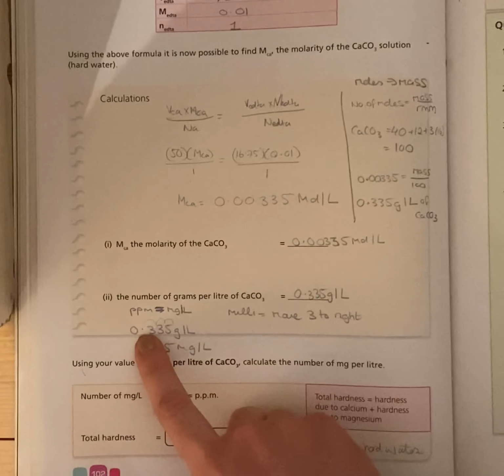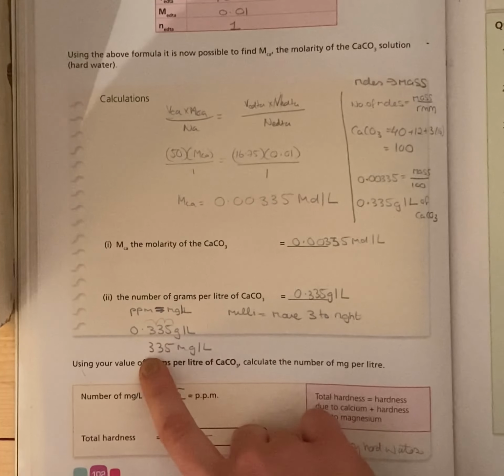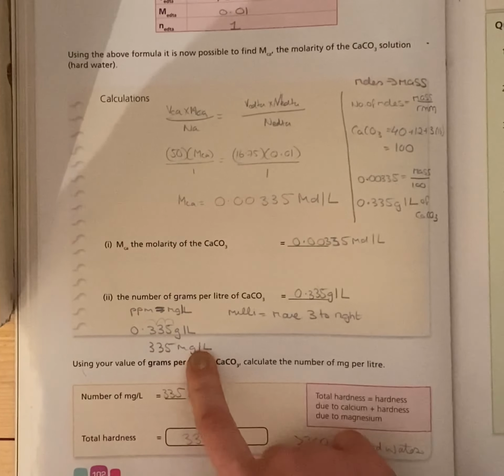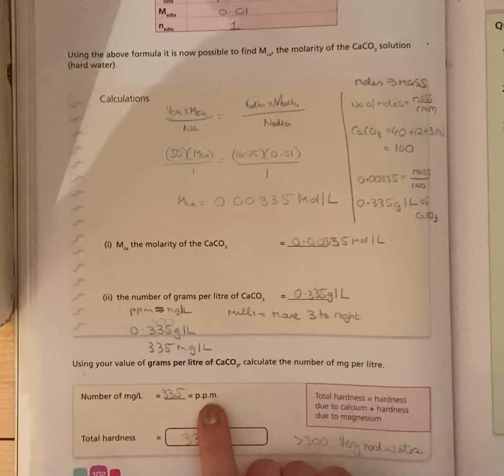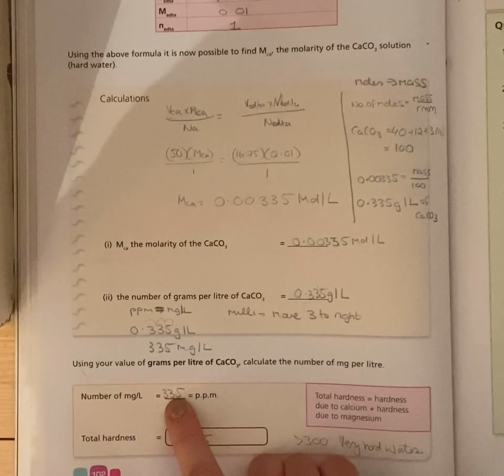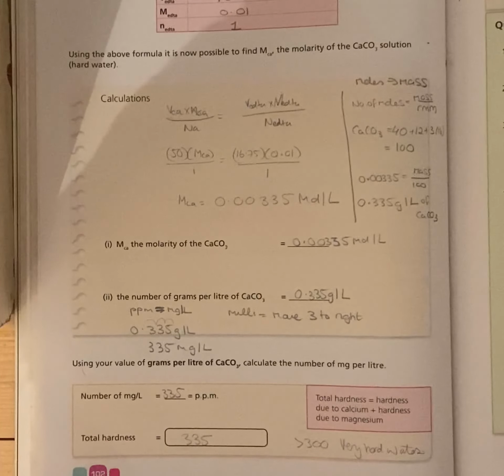So I have 0.335. So do 3 bunny hops backwards, and you get 335 milligrams per litre. So the number of milligrams is the same as parts per million, 335. So the total hardness is 335, which is greater.